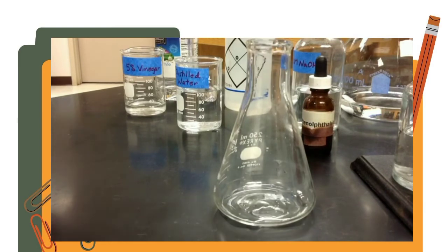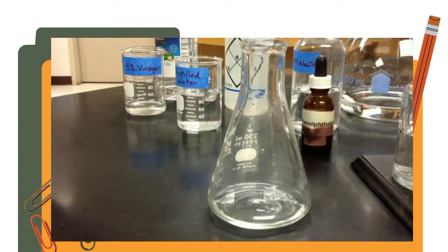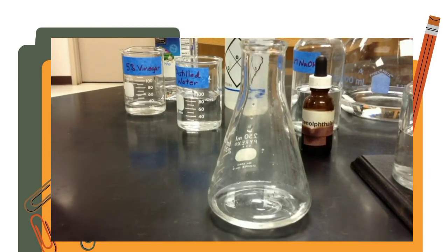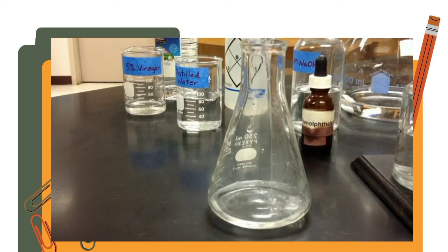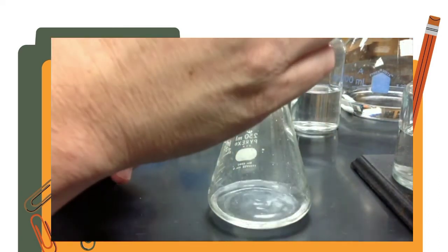To that, we will then gather 20 milliliters of distilled water. So I will gather 5 milliliters, and we'll do that 4 times. So 1, and gather another 5, and I will gather another 5, and the last set of 5 is 20 milliliters. 25 milliliters solution, 5 milliliters vinegar and 20 milliliters water, and to that we'll add 5 drops of phenolphthalein solution.